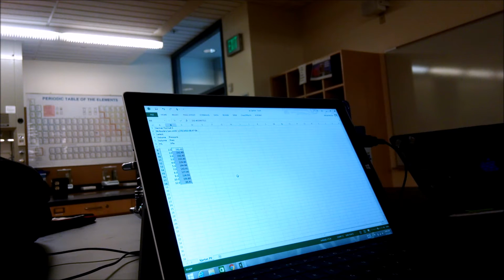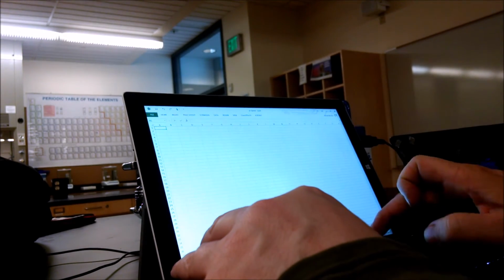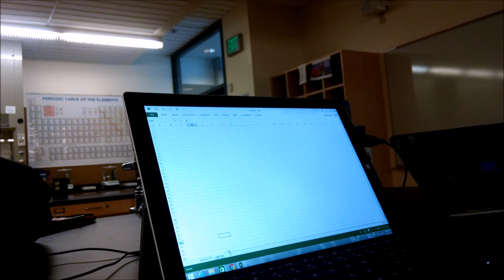Okay, now we're going to be adding a second sheet to the file and renaming it Calc 1. Rename it Calc (1). Yep. Okay, and then what's it say? Use formulas to reproduce in the Calc 1 sheet the data from the Data 1 sheet.